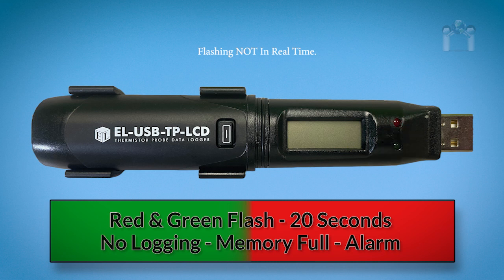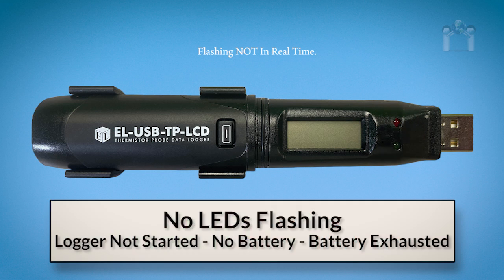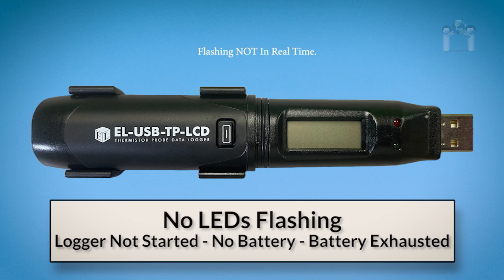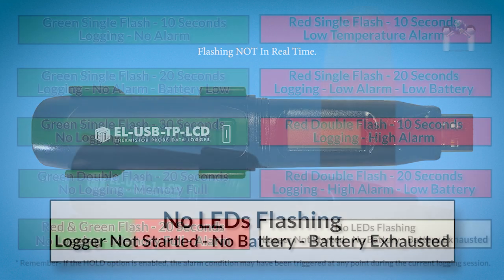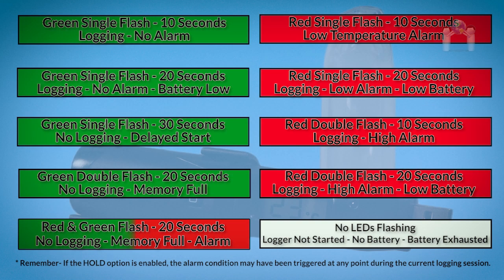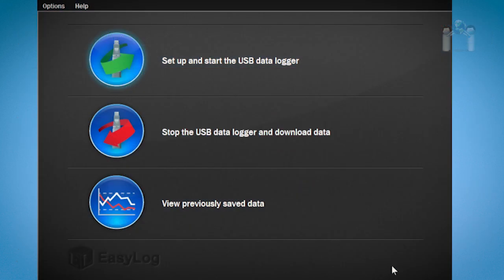A red and green single flash every 20 seconds means the memory is full and has stopped logging, an alarm high, low, or both has been triggered. No LEDs flashing means the data logger has stopped, the data logger hasn't been primed, the battery is dead, or one needs to be installed. For your convenience here's a list of LED codes and their meanings.